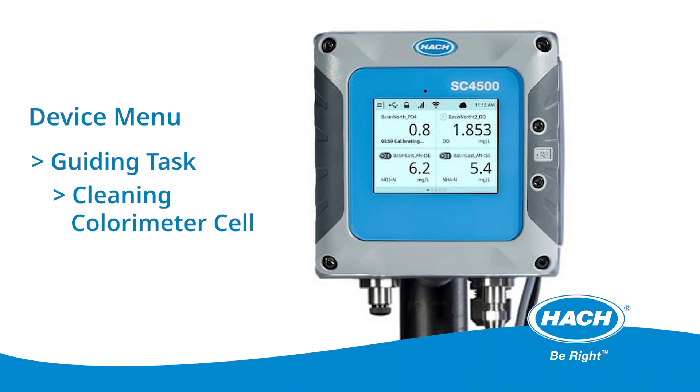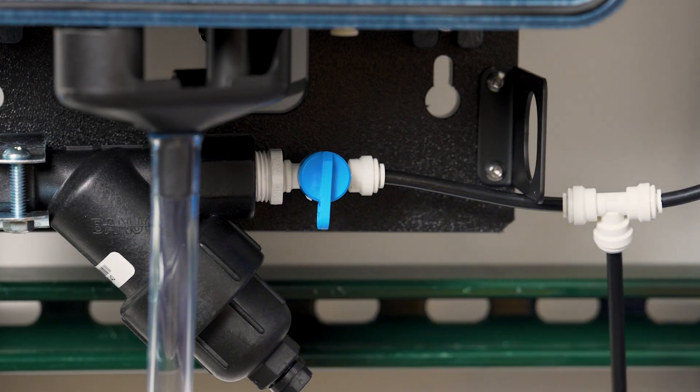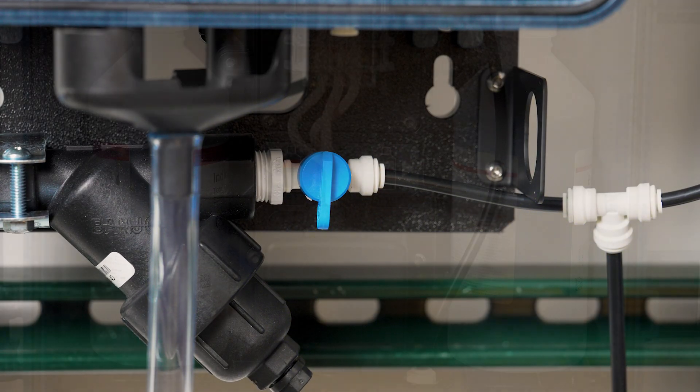The unit will flush when the light is solid. Turn off Influent Flow, then remove the cell lid from the colorimeter.